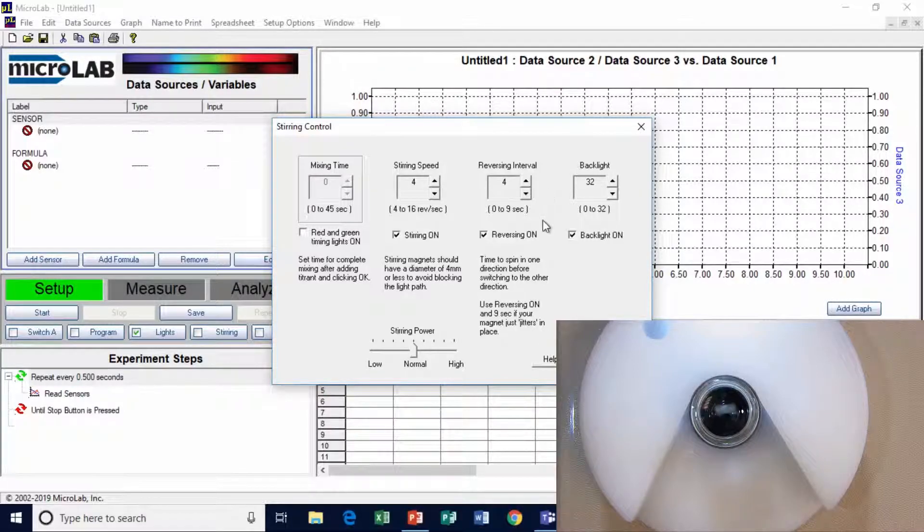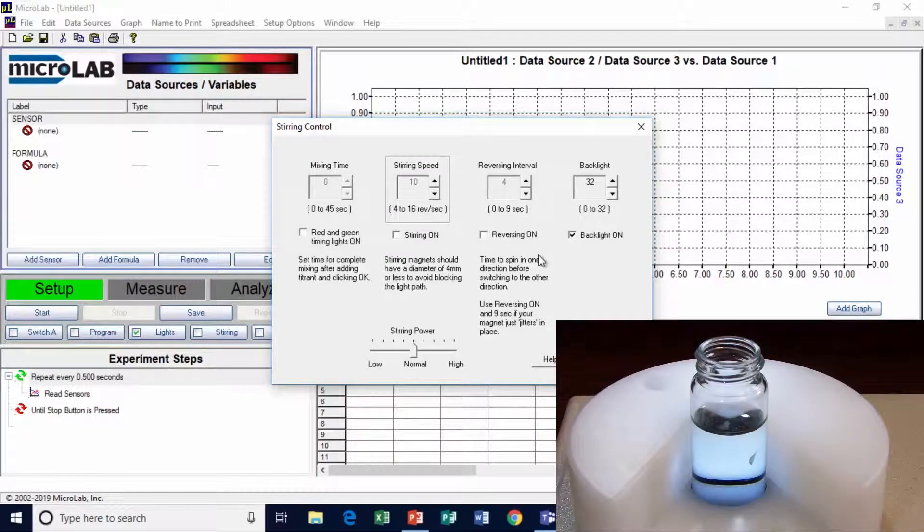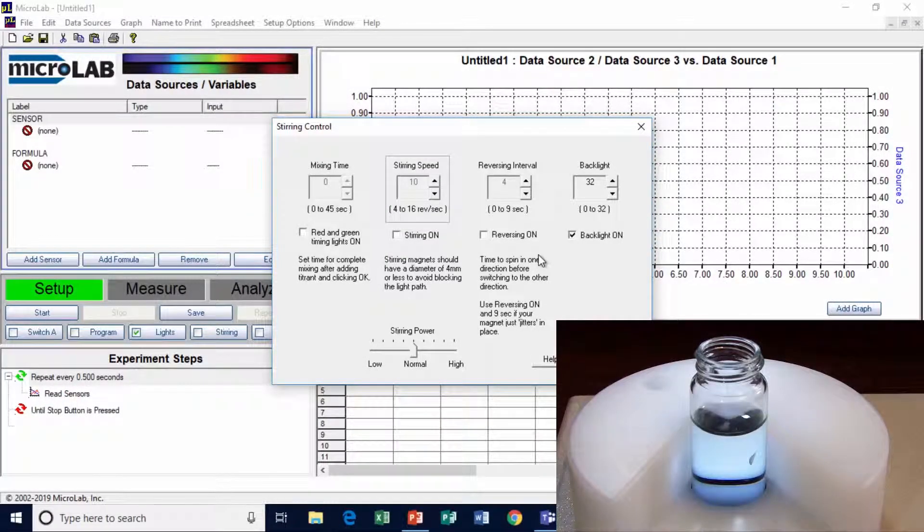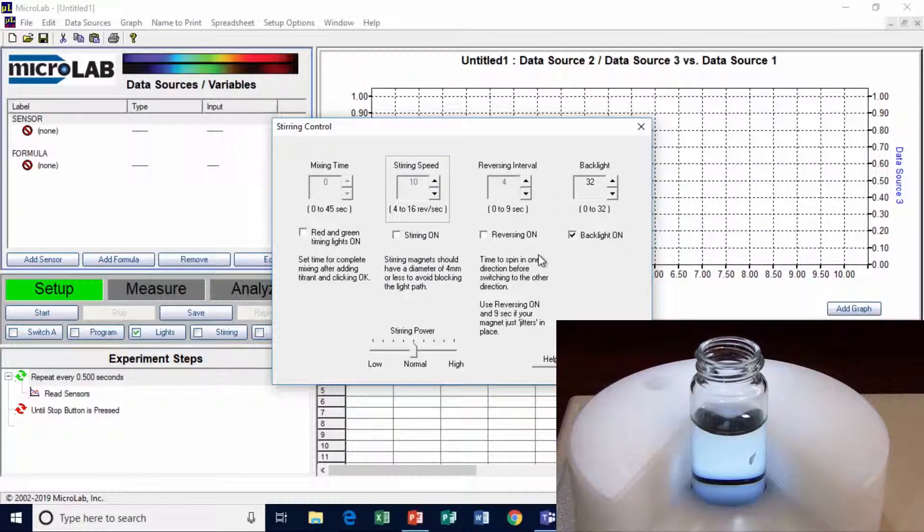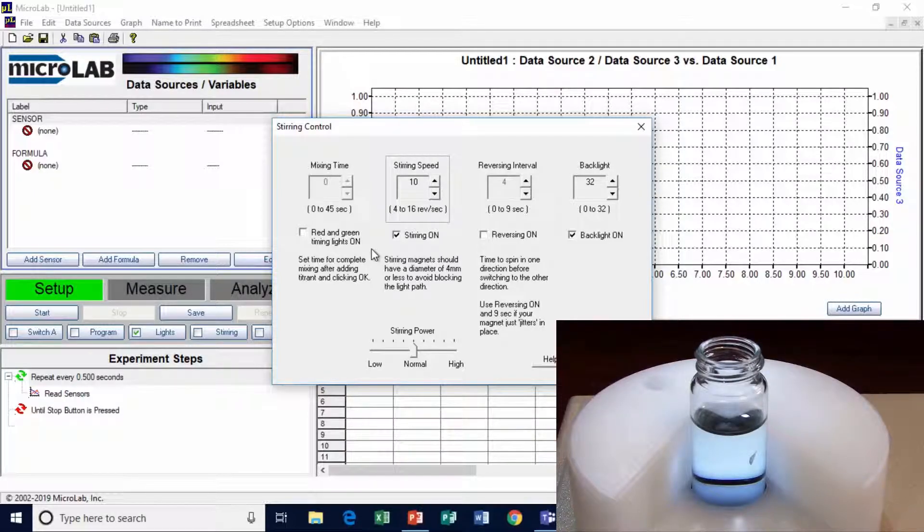And the purpose of that is to break up a vortex and make it mix a lot quicker. Backlighting control is available right here just as always. We have the vial in, an oblique shot at it right now. You can see reflected in the meniscus the stirring bar on the bottom. Now I'm going to start it, and I'm going to do what's called laminar stirring. I'm stirring just in one direction. It will not reverse.